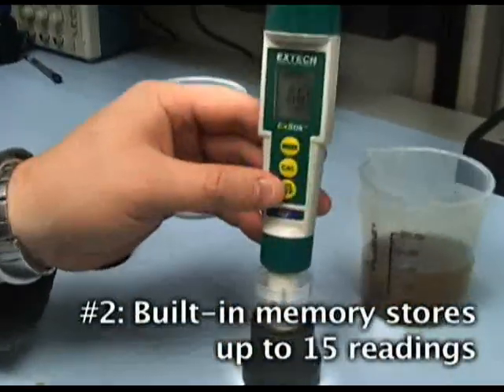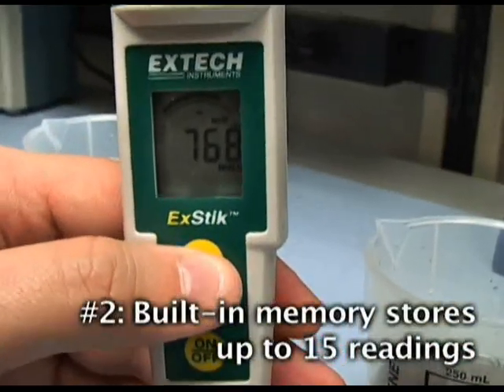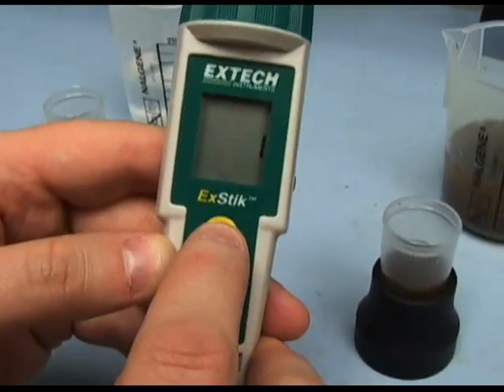2. Internal memory allows for data recording of up to 15 readings and are labeled sequentially for easy recall. This feature eliminates the need to bring samples back to the lab. It not only saves time but provides maximum accuracy for on-the-spot data recording.